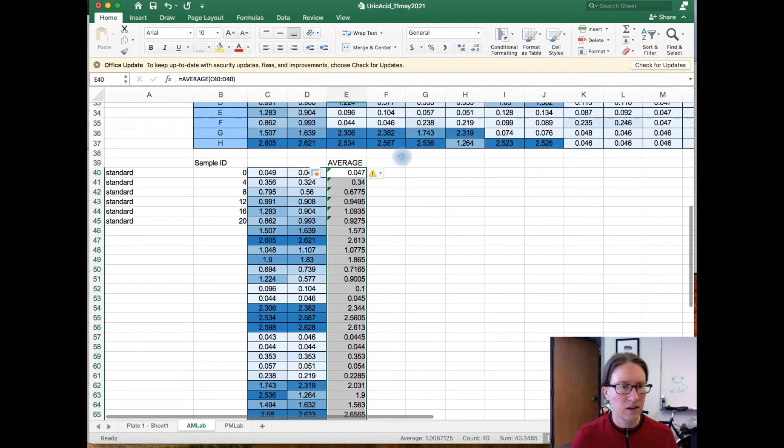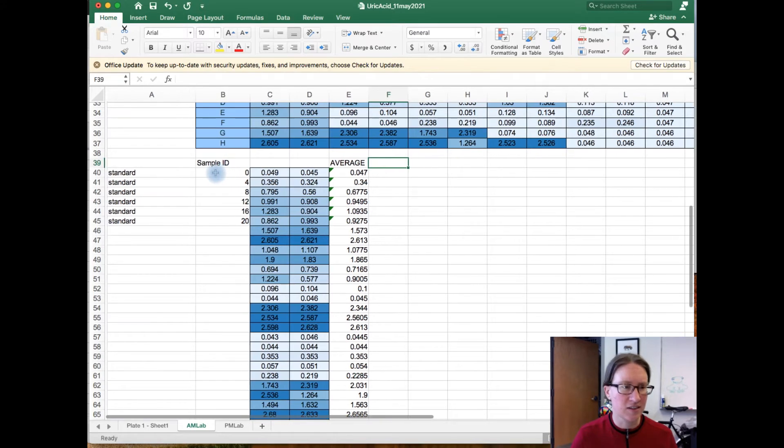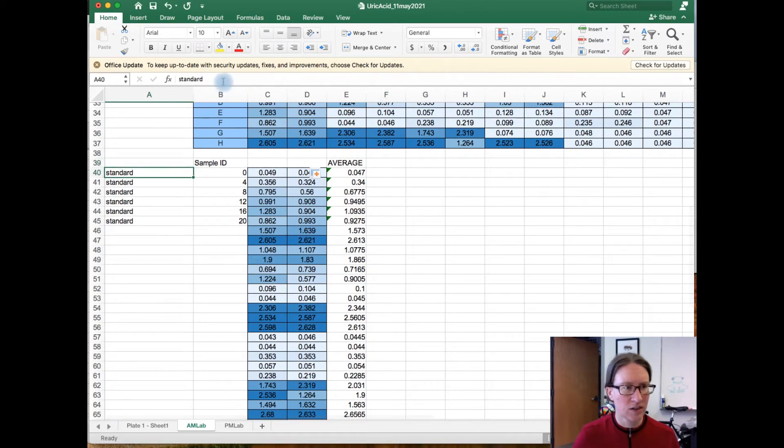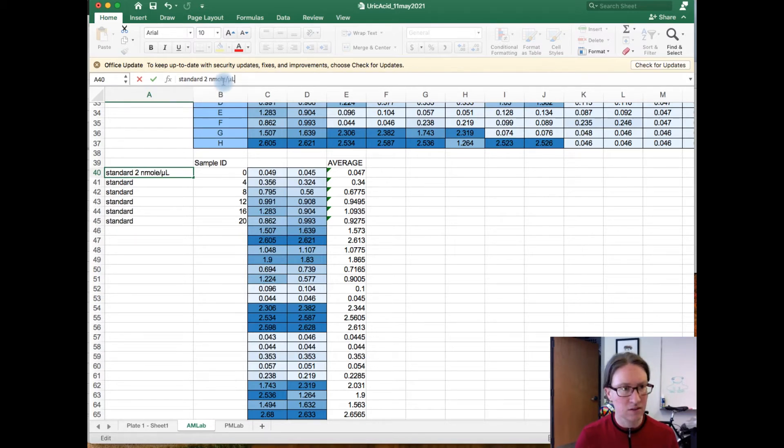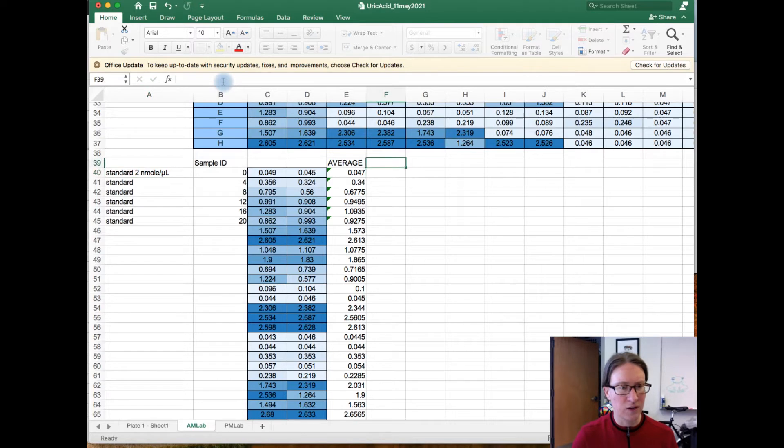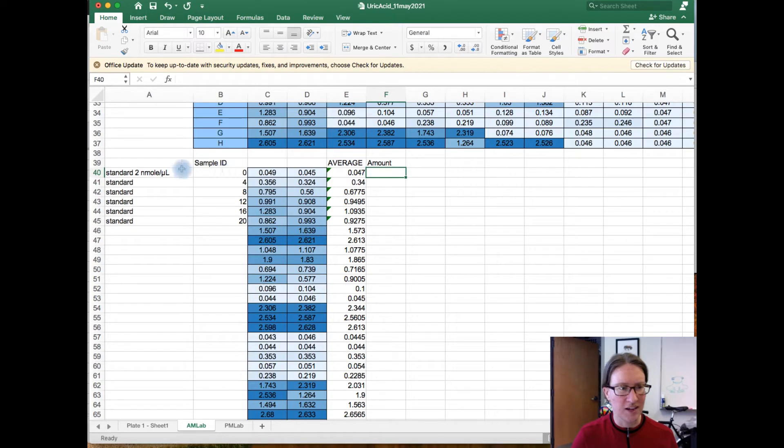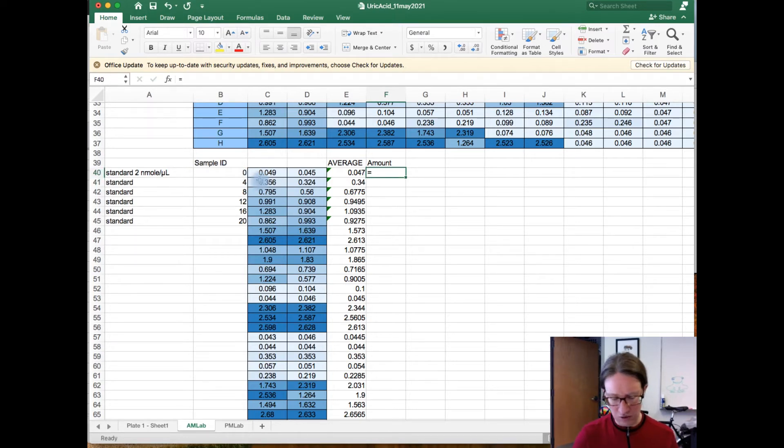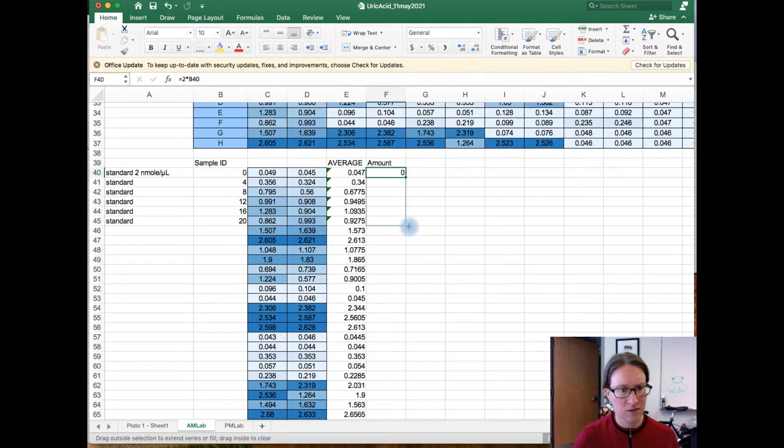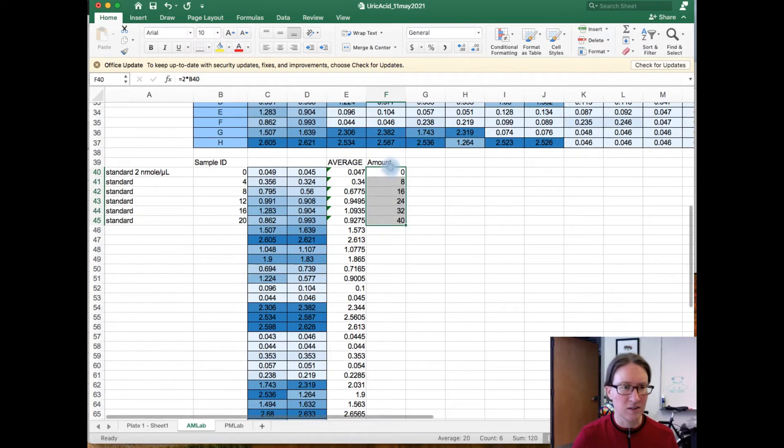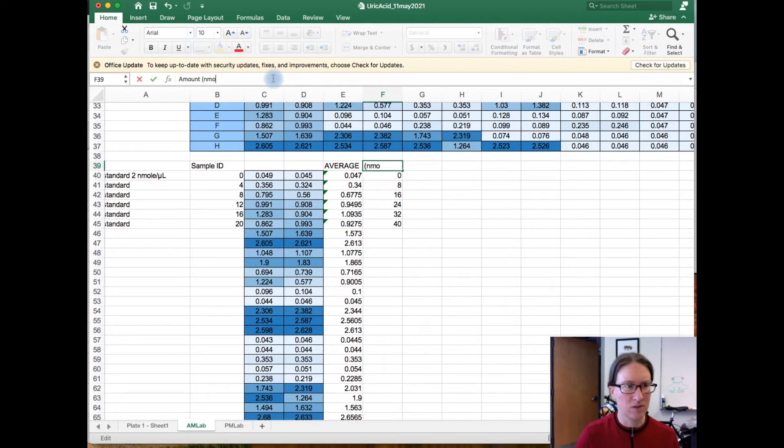And then for my standards, I can use the volume of standard that I added. The standard is at a concentration of two nanomoles per microliter, to figure out the amount of uric acid that I added in each case. And so that's just going to be multiplying the standard concentration against the volume that I added. In this case, zero, so that's just going to be zero. Or I could also say two times zero for that cell. If I drag this down, that's going to give me the total amount of uric acid present in units of nanomoles.